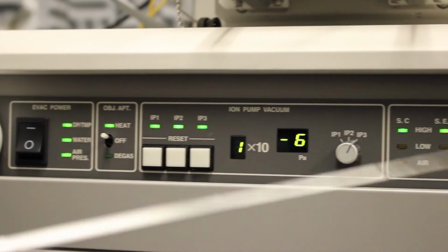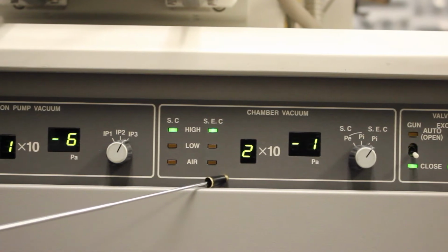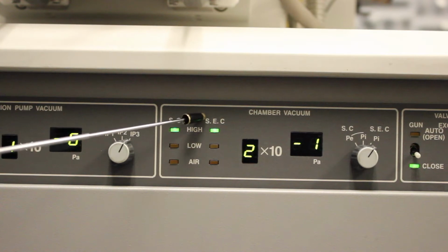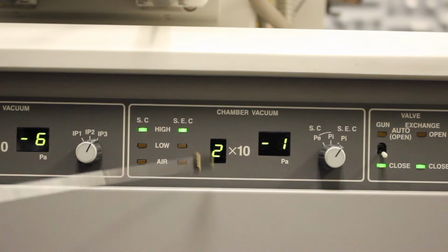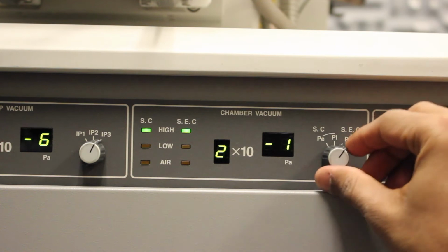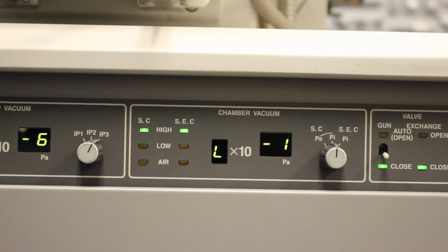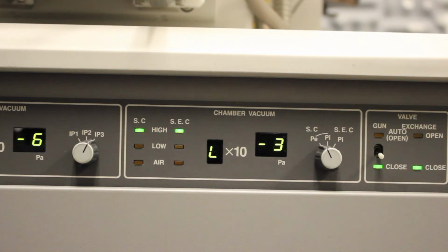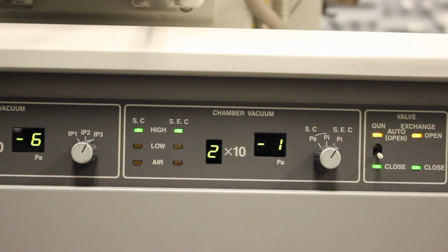Next we go to the chamber vacuum. SC stands for specimen chamber, and SEC is the specimen exchange chamber. Both should be in high vacuum mode. 2 times 10 to the minus 1 is the typical default for the specimen exchange chamber. So now check the specimen chamber, and a typical value less than 10 to the minus 1 is good. Then we check with the penning gauge, and that should typically be less than 10 to the minus 3. Then you return the switch back to SEC.